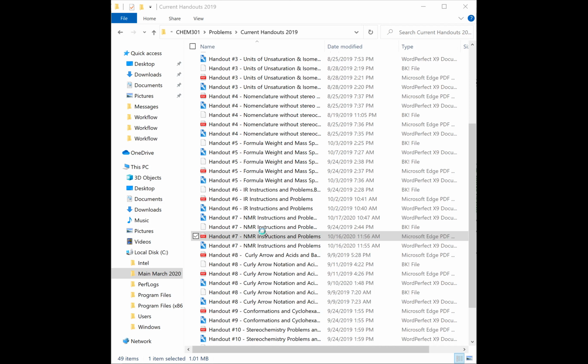Now this one's a little harder. So basically you're going to see this nice tall peak, this singlet, and then you're going to see a doublet somewhere, and then you're going to see a triplet somewhere, and the triplet's going to be a little smaller. So you're going to see something like that, but the key is usually that singlet sticks out, right? That singlet sticks out. Now, what if they're exactly opposite each other and identical? I like this one because you have perfect symmetry. A's don't split A's. So you are going to have 1 singlet that integrates for 4.